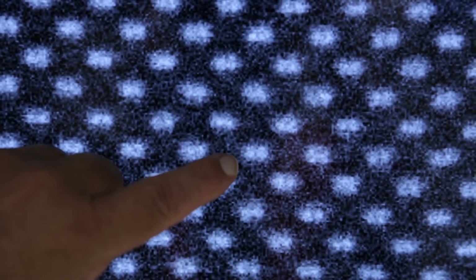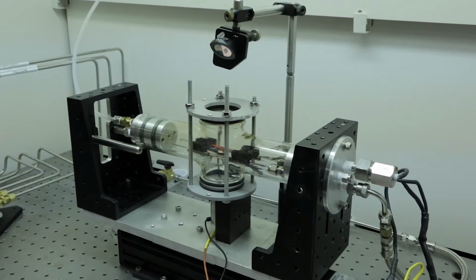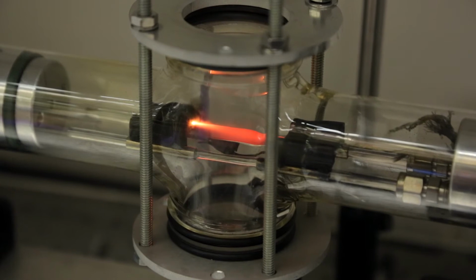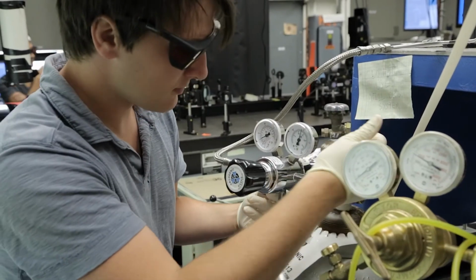And the great thing about these images, okay, so you're looking at these individual atomic columns. We're actually down in the picometer regime. These days we don't do nano, we do pico. My research is on graphene and carbon nanotubes, which are one-dimensional and two-dimensional crystals. So some of our projects revolve around trying to influence the crystal structure of graphene so it has better conduction. In another one of our projects, where we're growing carbon nanotubes, we're trying to alter their crystal structure by changing the nanoparticles that they're grown off of.